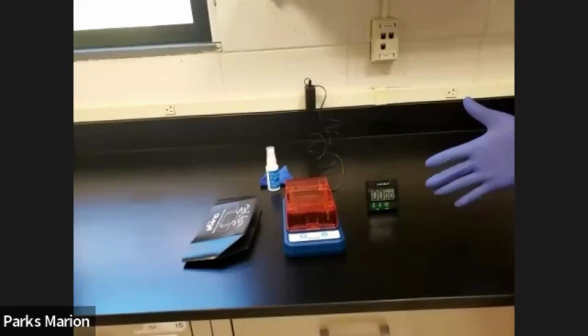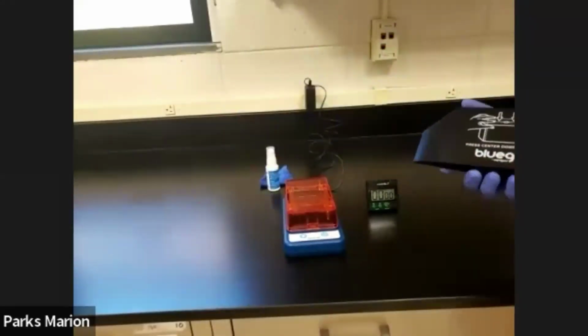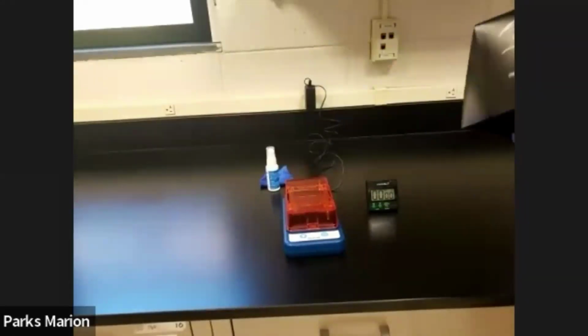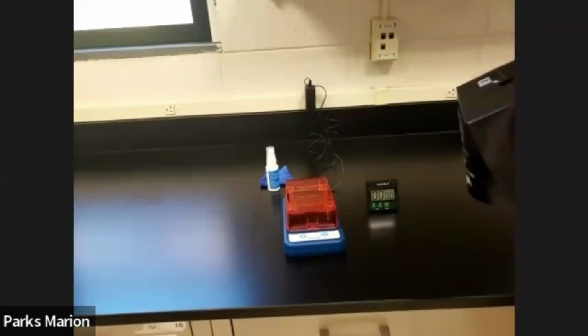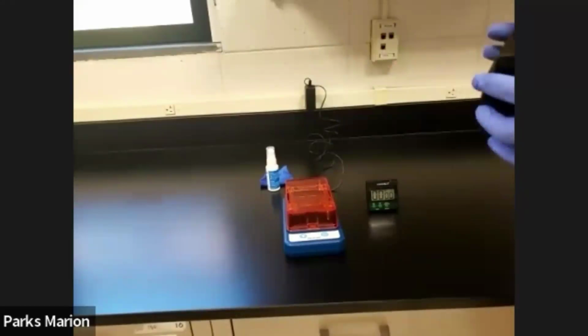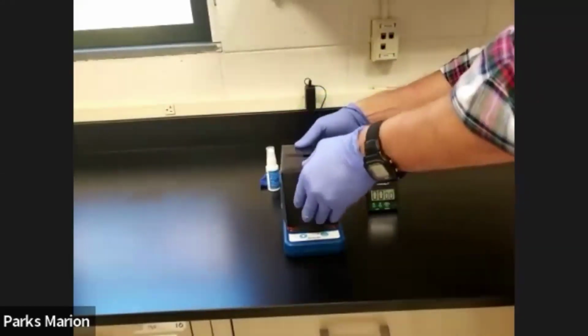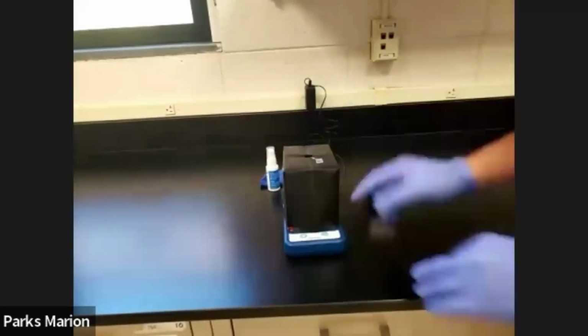Now that 45 minutes has passed, we're going to apply our viewing hood or viewing cover. You're going to unfold it like this. Now, when we view this, we have to use our smartphone. We cannot look directly at it. It will harm our eyes. So we'll cover this up like so.